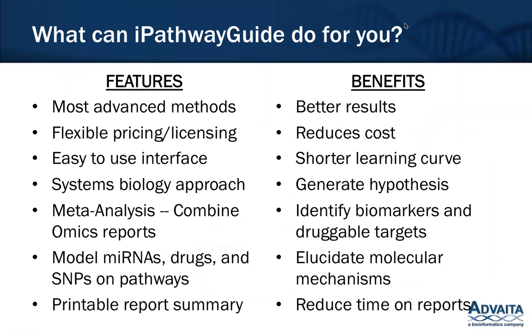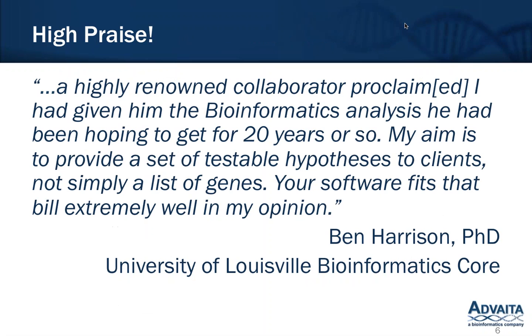Some of the key features and benefits of iPathwayGuide are the method, and I'll explain in detail what that method is, that really helps drive significant results or meaningful results that you can take for your next experiment. We also have a very flexible pricing and licensing model, which helps to reduce your costs. And we have a very easy to use interface, which helps to shorten that learning curve. So you don't have to be a bioinformatician in order to use iPathwayGuide. There are a few other features and benefits that you can read there, but those are, I think, some of the key things that we like to highlight for iPathwayGuide.